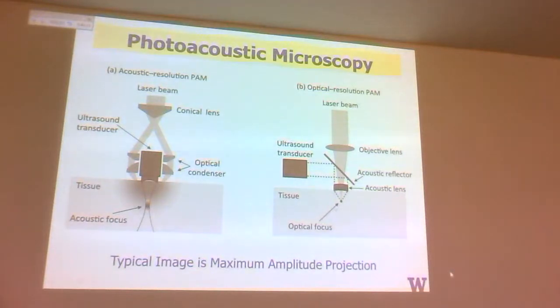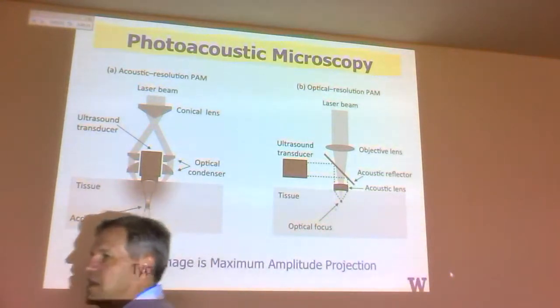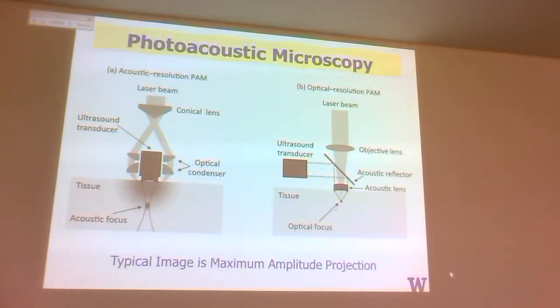This one, though, is the more modern, the optical resolution photoacoustic microscopy, which just goes to the other extreme. It says we got into photoacoustics to get around the diffusion limit, but can we use it when we're not in the diffusion limit, when we're in the ballistic level? So now, this optical resolution says, make the finest kind of optical delivery system you can, similar to what you'd have with the confocal system, although it's not confocal, to get a diffraction-limited optical spot, so in the order of micron or even submicron resolution, okay?